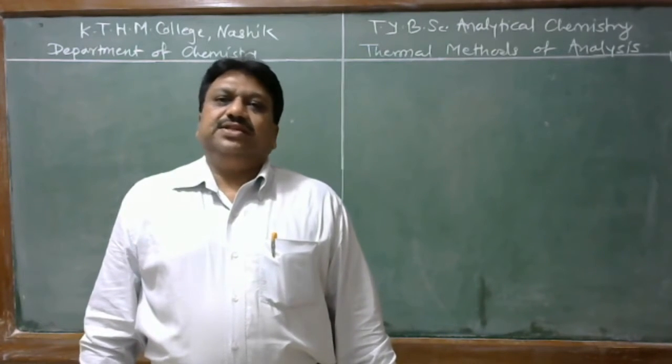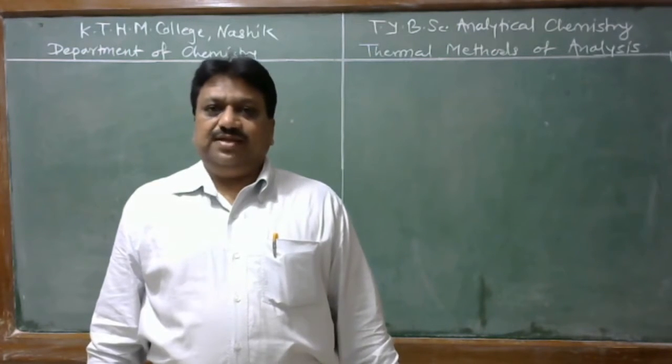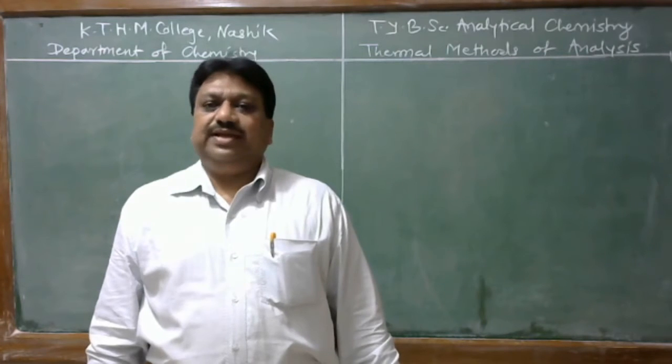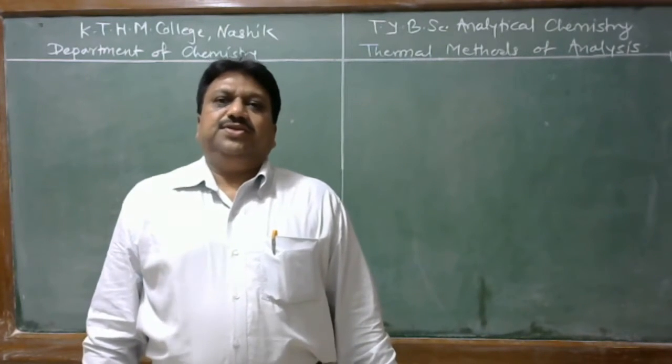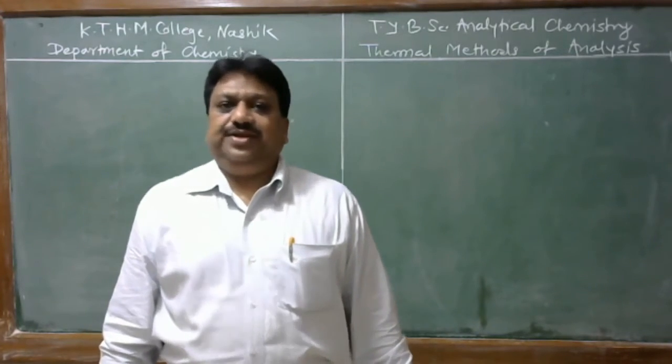Students, in the previous lecture we discussed the classification of thermal methods of analysis, and we also discussed thermogravimetric analysis and types of thermogravimetric analysis. In today's lecture, we discuss the instrumentation of thermogravimetry.